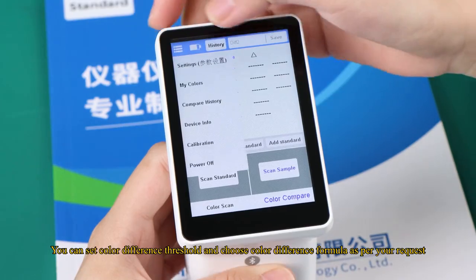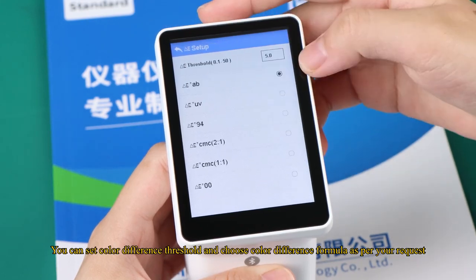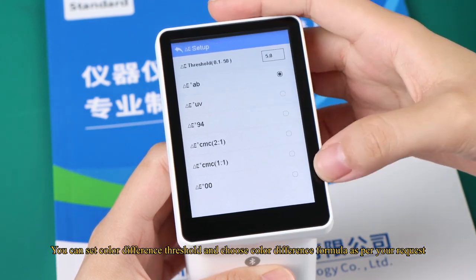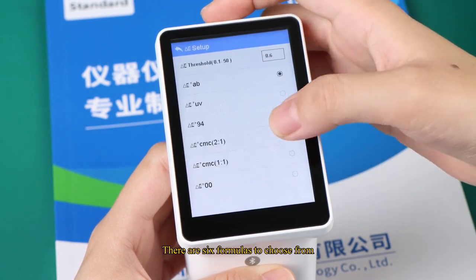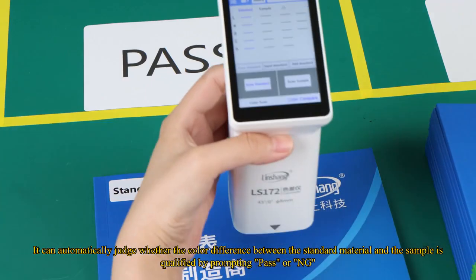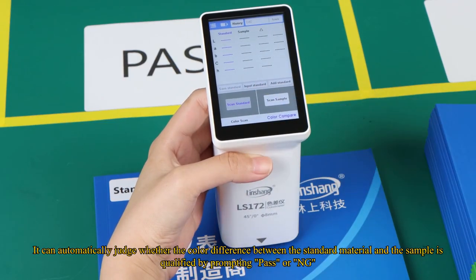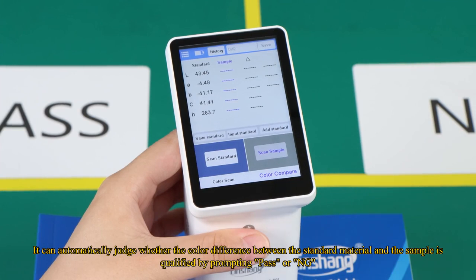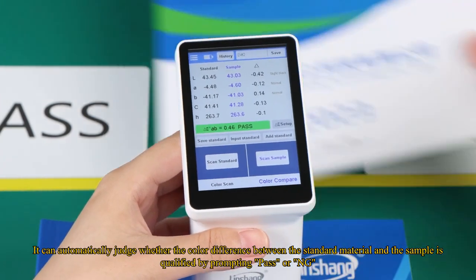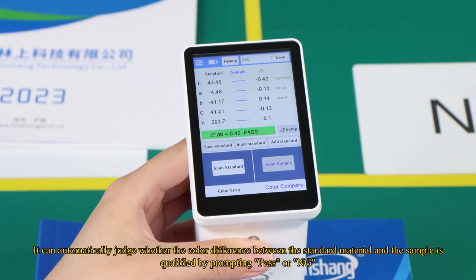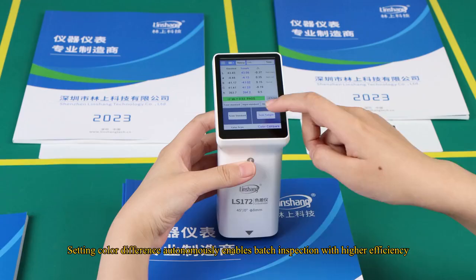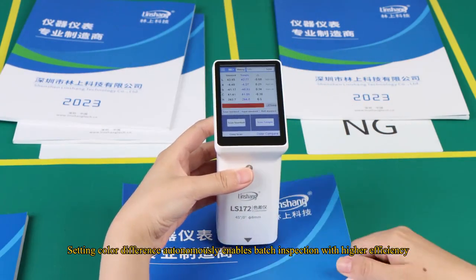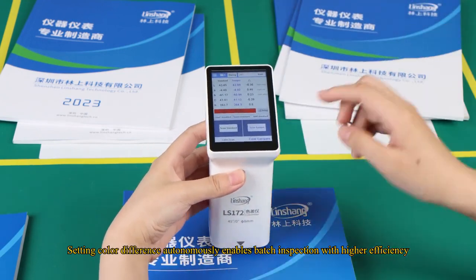You can set color difference threshold and choose color difference formula as per your request. There are six formulas to choose from. It can automatically judge whether the color difference between the standard material and the sample is qualified by prompting pass or NG. Setting color difference autonomously enables batch inspection with higher efficiency.